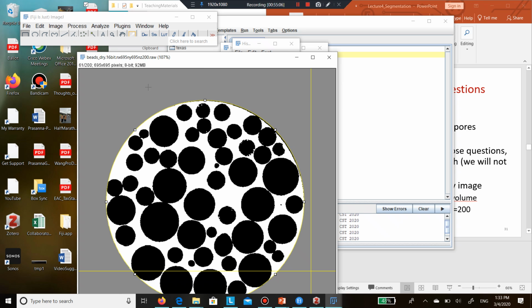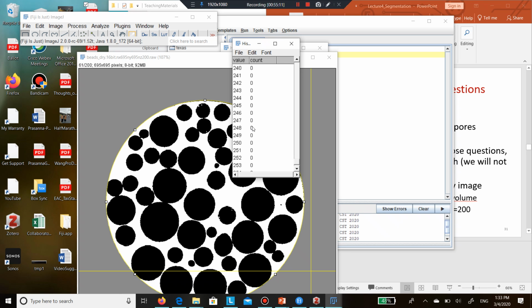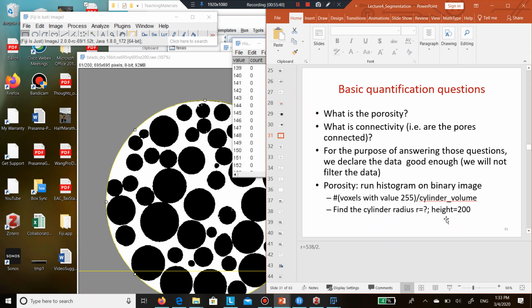This background for me is 140, and it doesn't appear to show in the histogram. I can check that right there. You're going to get a peak if it shows up. But that's because clear outside is correctly not including this 140 right there. So you have to be careful with that. And again, we can figure out.